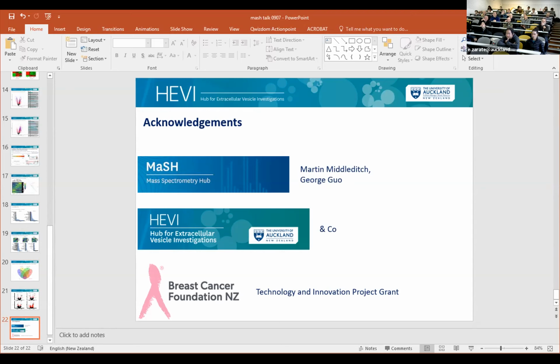We're doing it also. I started off doing it in blueberry, but at the time I didn't have access to the FTICR, so we weren't getting great results from it. So we switched to bilberry because it's smaller and easier to work with too in terms of sectioning. That's in the pipeline, to repeat this exact art. Then we can compare basically the blueberry, which has white flesh, with the bilberry that has red flesh. Yeah, so it was just logistics that we started on this one.